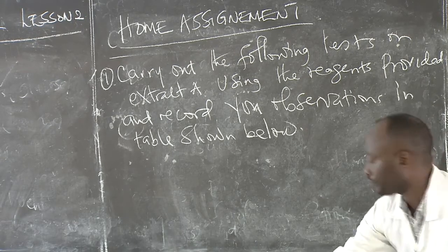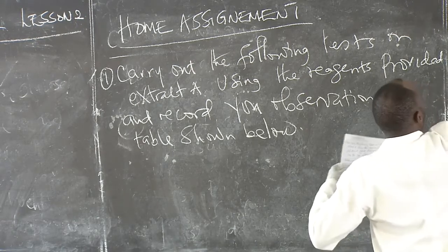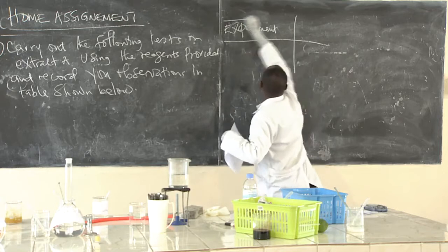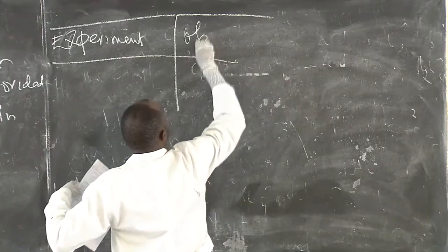This is the experiment. These are the observations.